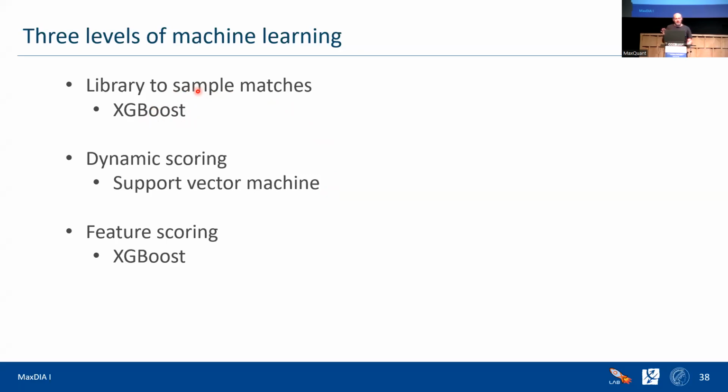Because of that, if you made a mistake in the first scoring, taking the wrong solution as the top scoring, and let's say the second top scoring is actually the true solution, you will not get the correct answer with the best machine learning in the world if you don't reorder these, or if you don't rescore all of the possible solutions. And this is very analogous here. That's what the dynamic scoring is for.